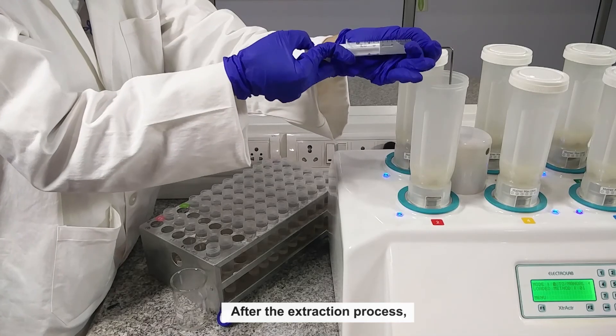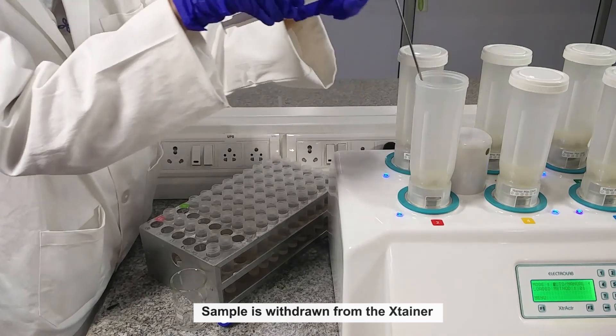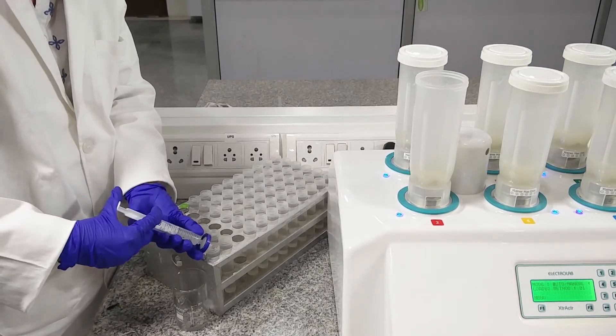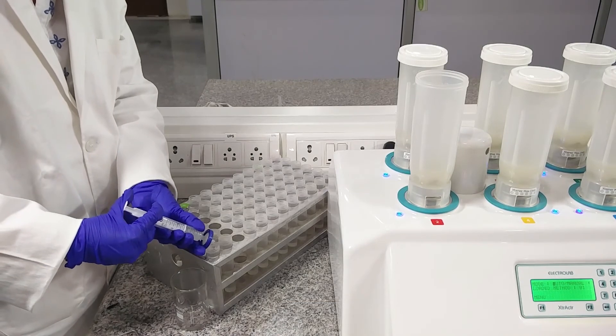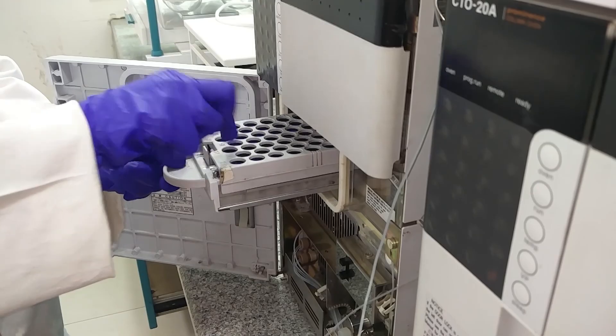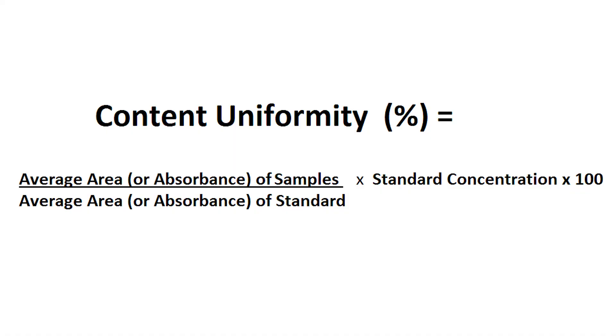After the extraction process, the sample is withdrawn from the Extainer, filtered, and diluted if required, then analyzed using either UV or HPLC. Percent content uniformity is determined by dividing the average area or absorbance of the 10 samples by the average area or absorbance of the standard, and further multiplied by the standard concentration.